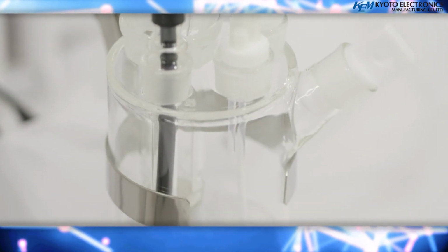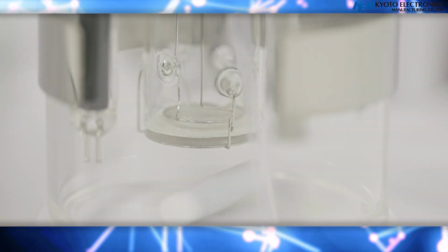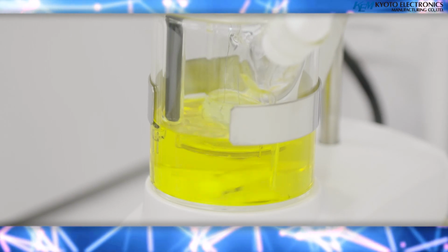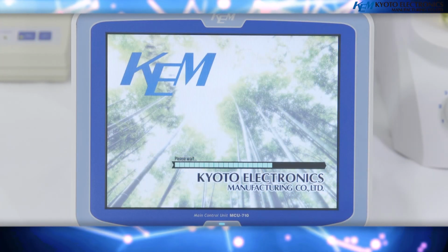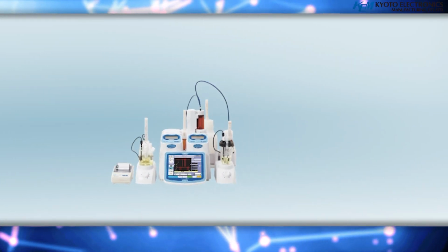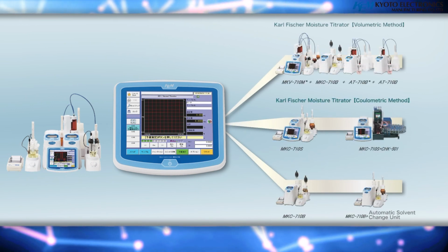The MKC 710 is widely used for determining the moisture content of various substances as a reliable moisture meter that has been adopted in many official analysis methods such as the ASTM, JIS, European Pharmacopoeia, and the United States Pharmacopoeia. By connecting up to 4 moisture titrators, measurements can be performed simultaneously in parallel and contribute to saving space.